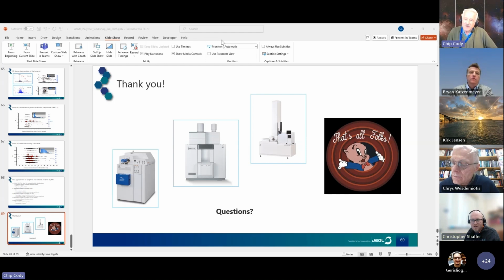Yeah, I mean, as you probably know, most GC people also run flame ionization because it's quantitative, because it's hard to get standards for all the different compound classes. So, I guess at least we have some qualitative way to see what the trend is. Yeah, and if you can semi-quantitatively translate that DBE value into, you can at least say the degree of oxidation early on.